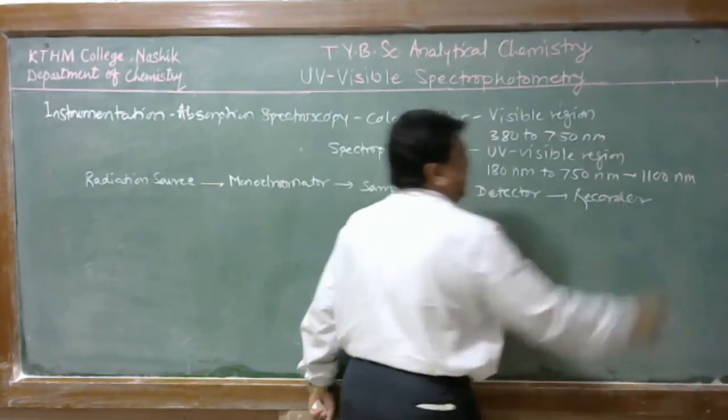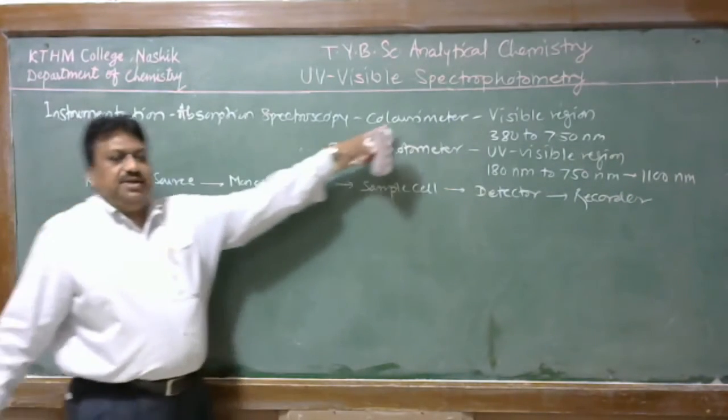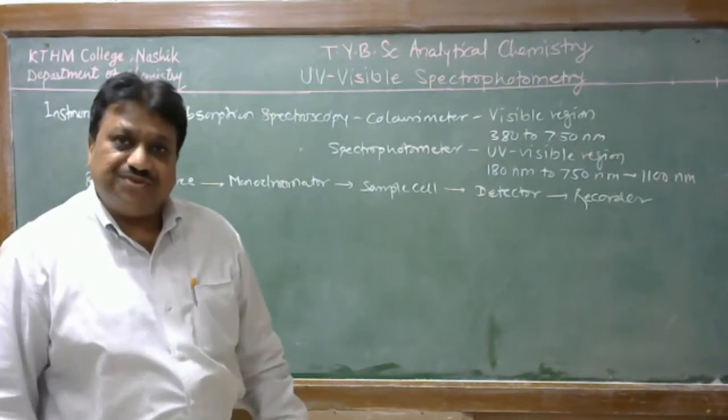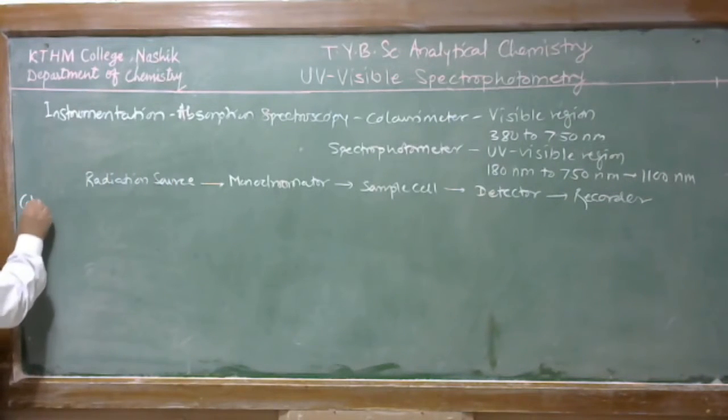This arrangement is also found in the colorimeter as well as the spectrophotometer, because these are instruments of absorption spectroscopy.